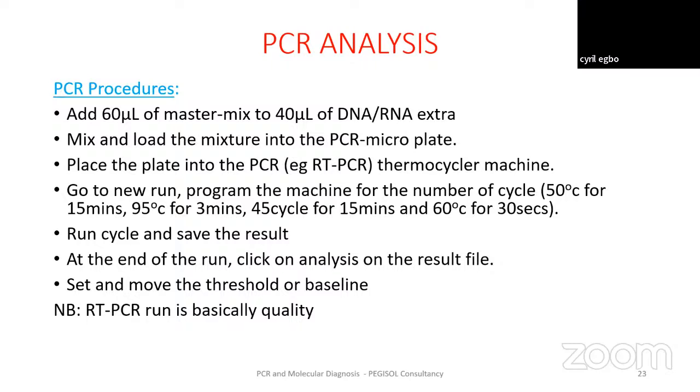So after which, that strand will be broken to release the strand to make it 2 strands, so that annealing will occur that will now give rise to 2 DNA templates. Then after which, those 2 DNA will be denatured again at this 95 degrees centigrade.